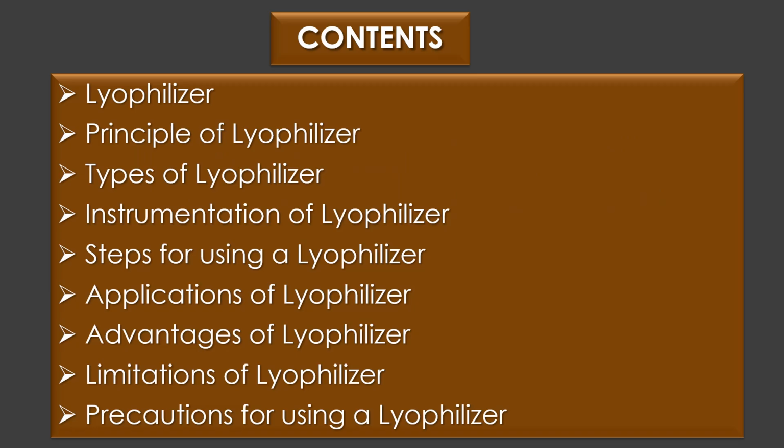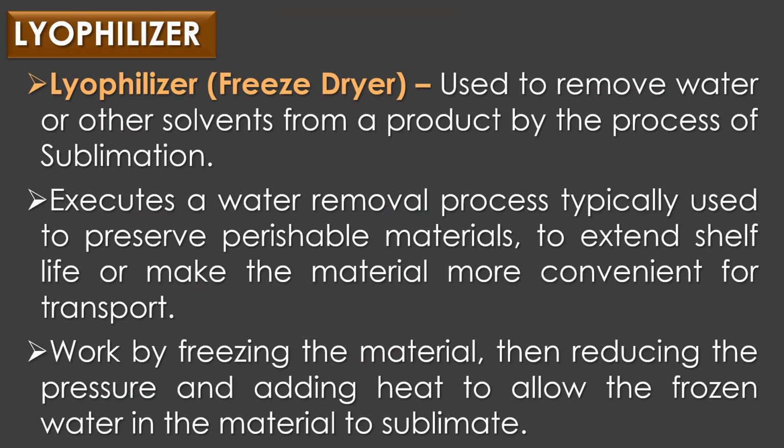The contents of this video includes an introduction about Lyophilizer, principle of Lyophilizer, types of Lyophilizer, instrumentation of Lyophilizer, steps for using a Lyophilizer, applications of Lyophilizer, advantages of Lyophilizer, limitations of Lyophilizer, and precautions for using a Lyophilizer.